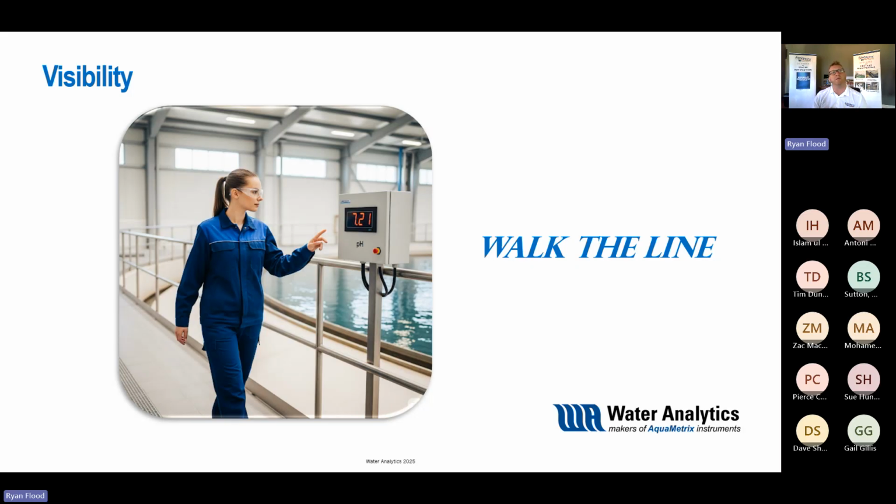What's the level of visibility that you need? Now, this is a very simple indicator in this example here. So then the question is, do they want other indication with it? Do you want an alarm present? Do you want to be able to see what that's trending over time as you walk past that? Do you want to be able to understand if a relay is activated, if an alarm is triggered, et cetera?